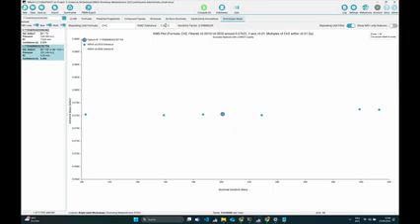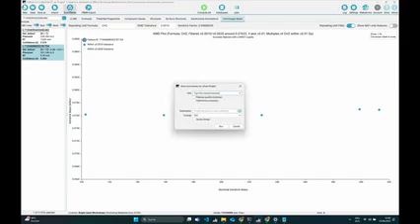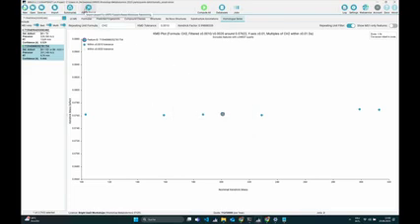Before I will show you this, you can also export whatever you have computed with this summaries button here. So there are some settings that you might want to select, but yeah, the top hits will then be exported to whatever location you specified. There's also an export for the feature-based molecular networking from GNPS. But now to the API, and I just want to show this very quickly.